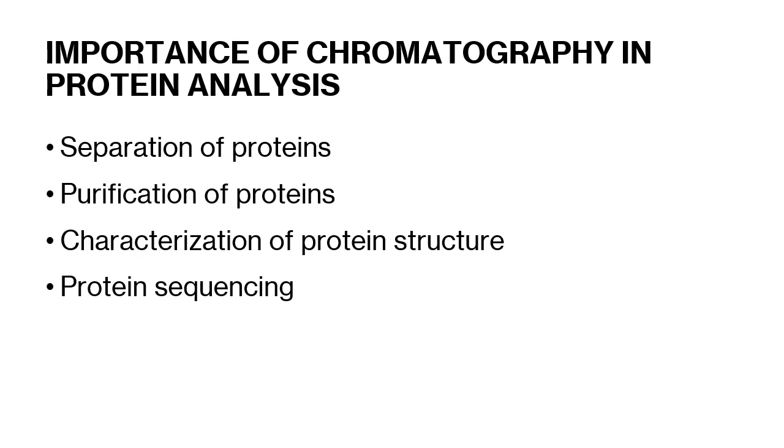Okay, and so your chromatography is also used in characterization of proteins, no? And so your chromatography can be coupled with the analytical techniques, no? Like your mass spectrometry. And so examples of this, you have your GCMS or your gas chromatography, mass spectrometry. And so these ones are used in analysis of many chemicals, not only for protein but also for other chemicals, no? And so they are coupled with this to provide information about the structure of your proteins, no? And so they're important for studying your post-translational modification of your proteins, no? And so the structural features of your proteins also, and the folding patterns.